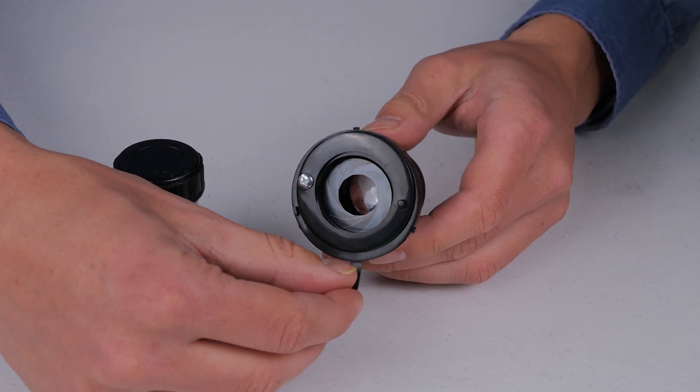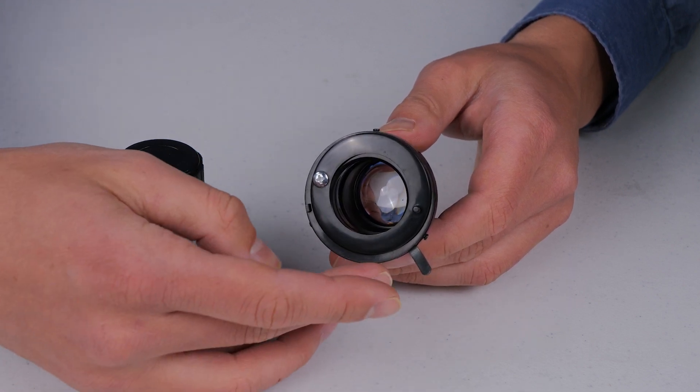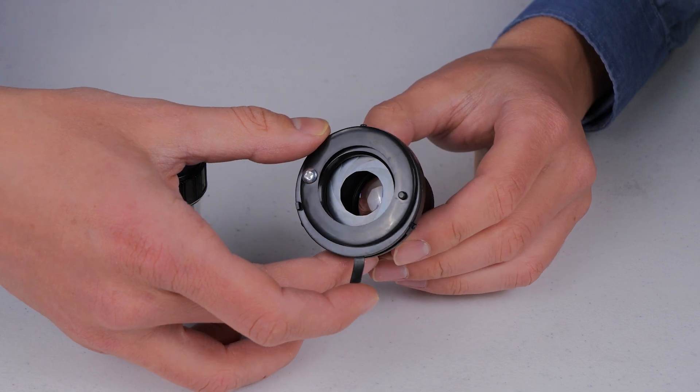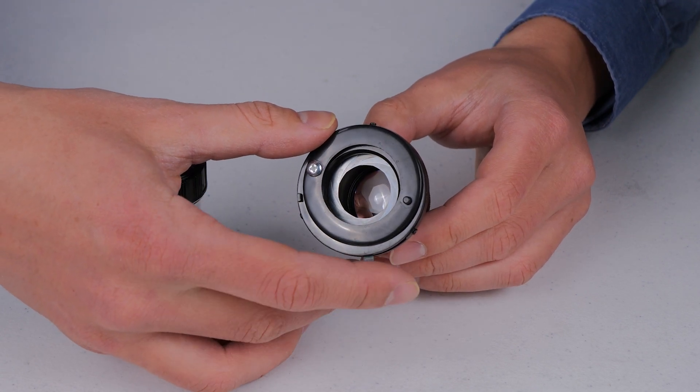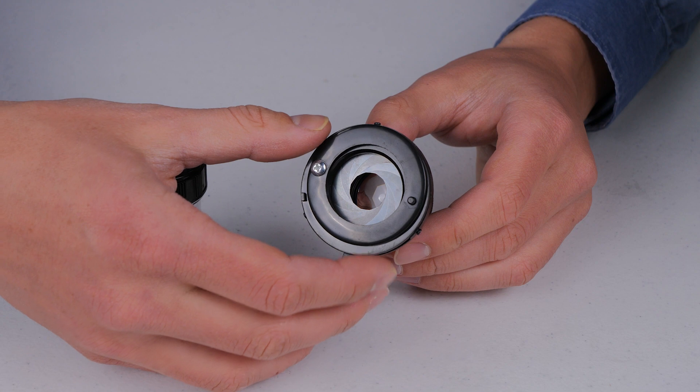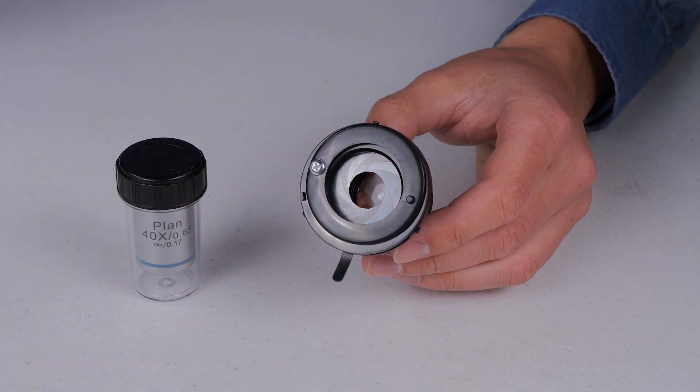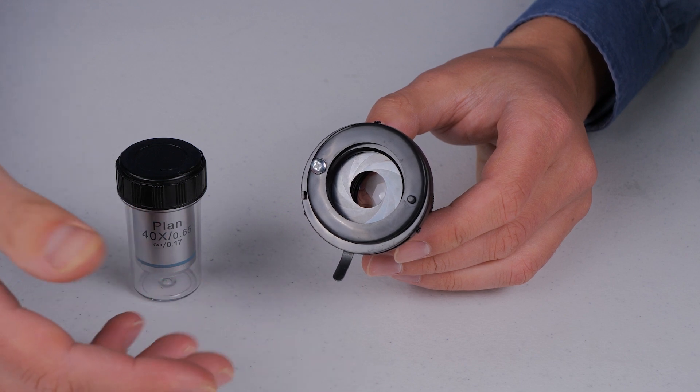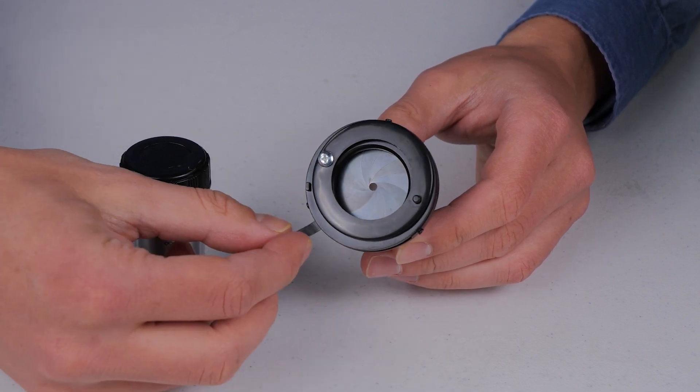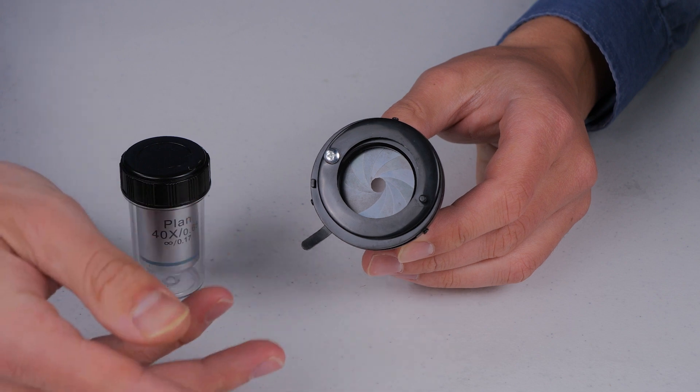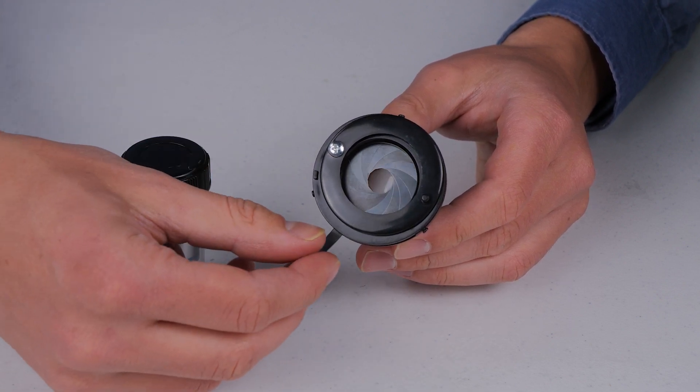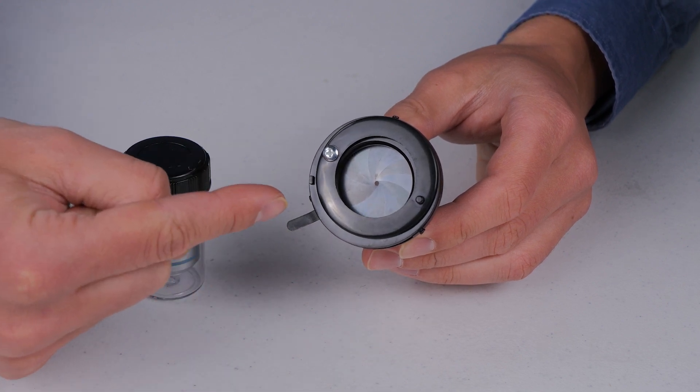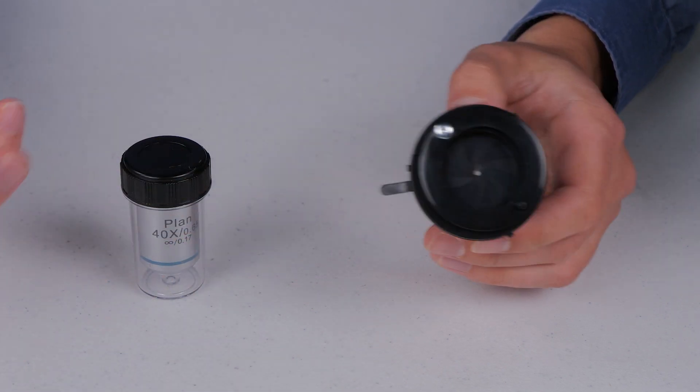Conversely, the reason that you don't just always have the microscope condenser all the way open is that you end up essentially reducing the contrast in the final image. It starts to wash things out if it's too high of a numerical aperture for the objective. And you don't really achieve any additional benefits. Usually this does change the total contrast of the image. So sometimes it actually is beneficial to be illuminating your sample with a lower numerical aperture than what your objective can actually handle.